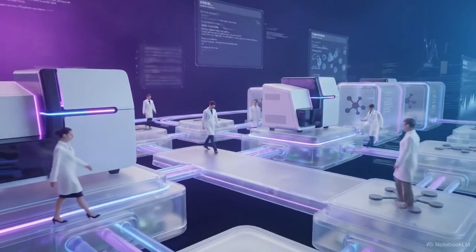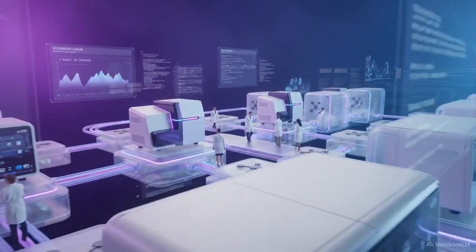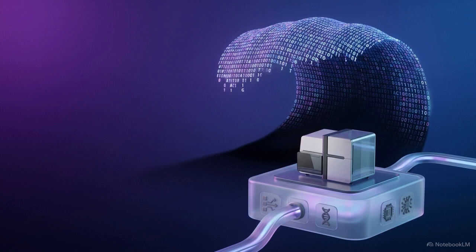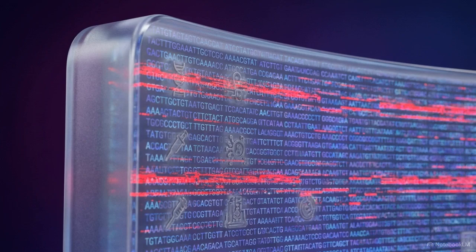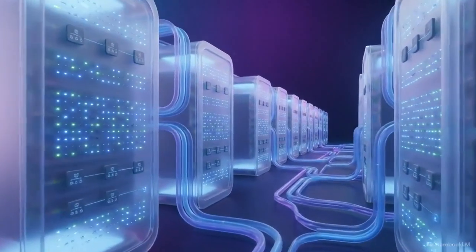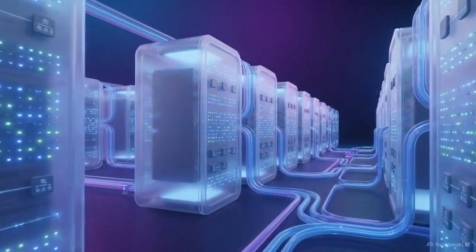Whole genomes can now be sequenced in days, with a dropping cost that makes large-scale genomics accessible to research labs worldwide. But this speed creates a new problem, a massive data deluge. A single modern sequencing run generates terabytes of raw, unstructured, and noisy data. Billions of DNA letters are useless on their own. We need a massive computational engine to filter that noise, align the fragments, and translate the code into specific medical insights.